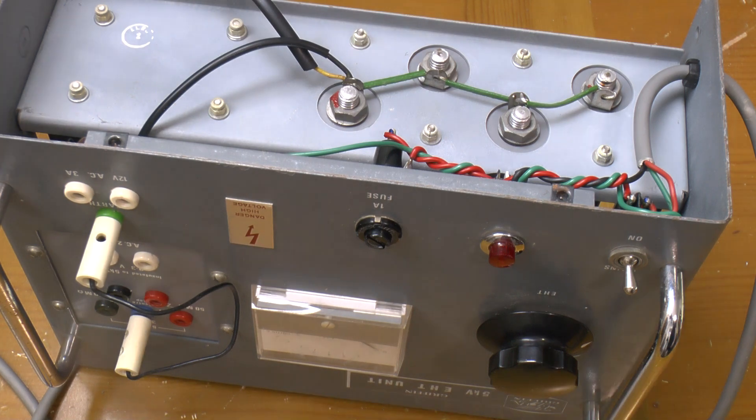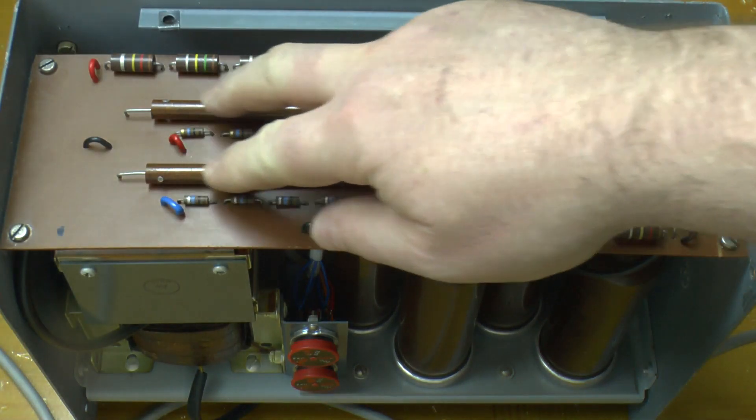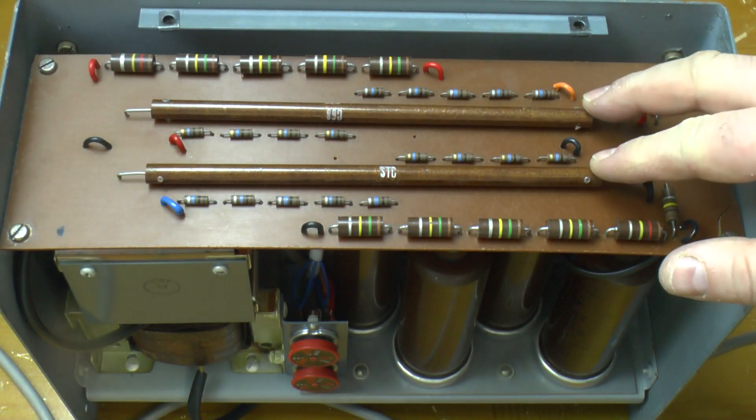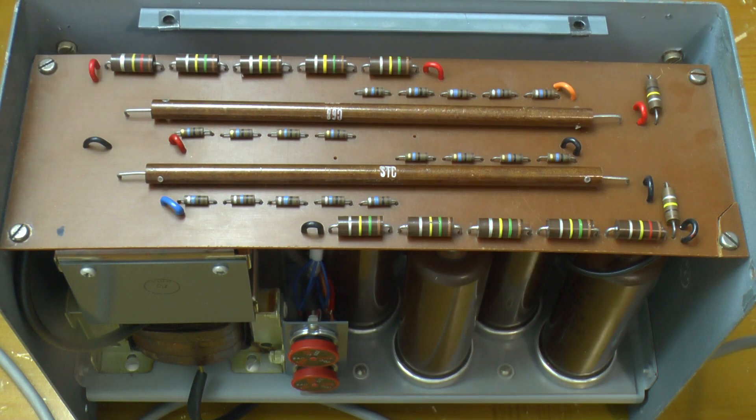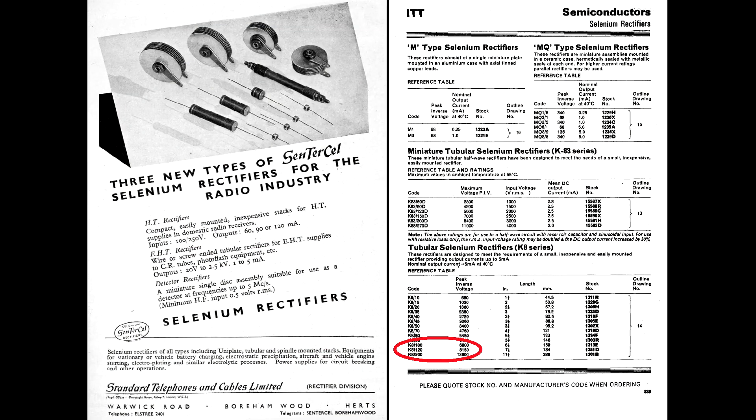What else is in here? Well there's a circuit board with two huge diodes. Again you've got to go digging through the archives to find anything out about these. They're branded STC which was Standard Telephones and Cables. They're part of ITT corporation. Hence this ITT data sheet containing the details. These particular ones are the K8120 rated at 8150 volts at 5 milliamps.